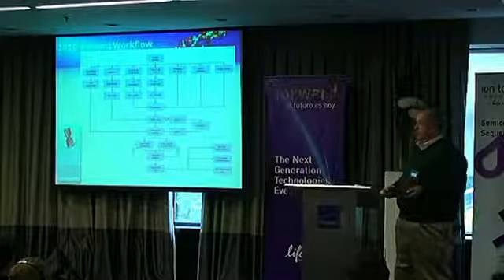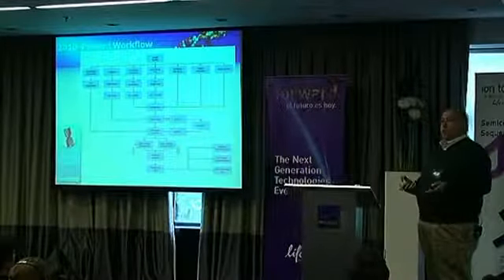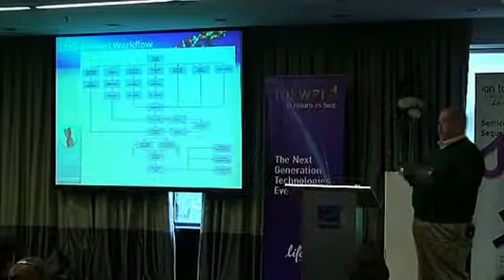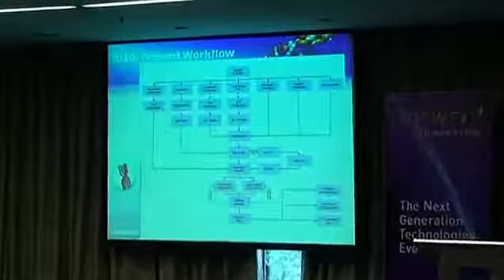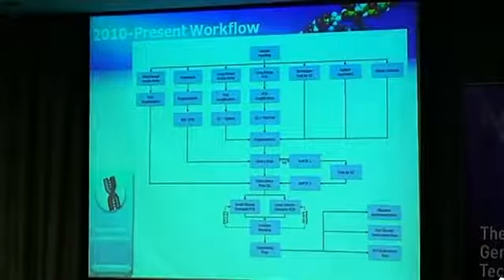But I think what we're going to see in 2013 or late 2012, what we really want to do is pare this back down, not lose any of the quality, not lose any of our ability or flexibility, but really pare down these processes and pare down the instrument that we feed. So we don't have to train so many people on so many different platforms.